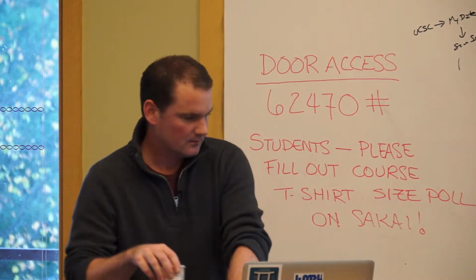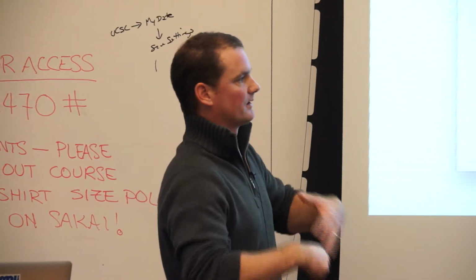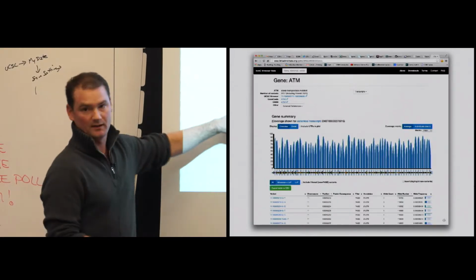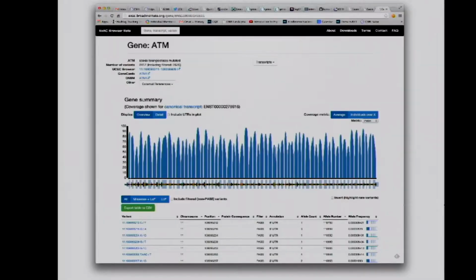So the EXAC consortium learned from the Exome Sequencing Project that to get these types of resources widely used by the community, as they should be, you need to make really convenient, nice interfaces to get at the data. If you go to exac.broadinstitute.org and type in your favorite gene, what you'll get is a fairly busy readout, because ATM, one of my favorite genes, is a really huge gene.